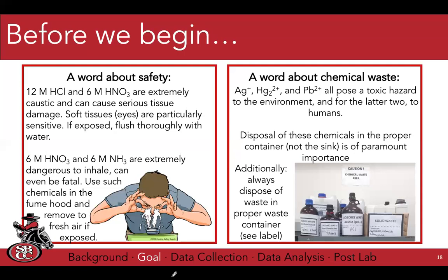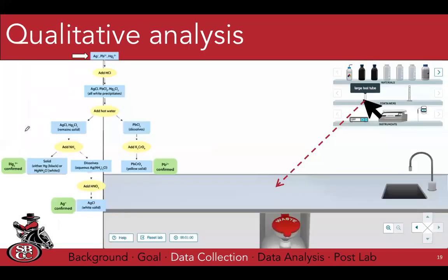And so specifically when we're dealing with toxic waste, in the back of your head, you should be thinking of disposal before the experiment begins. Okay, let's calibrate our sensors. So I'm going to keep this guide here, and we're going to walk ourselves down the branches of this tree.